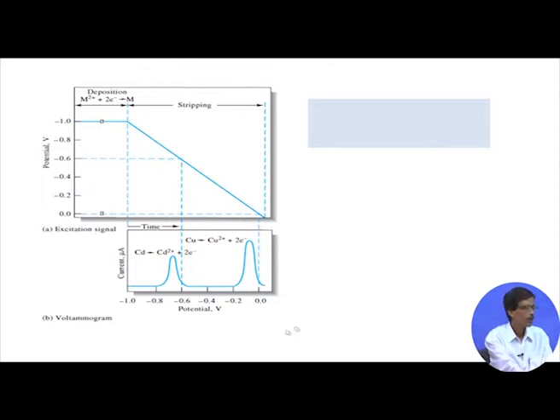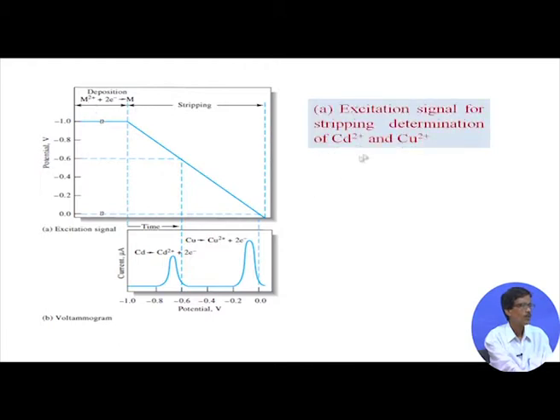So, you have the corresponding time axis, and this is your excitation signal. When we go for deposition, you require some excitation signal.